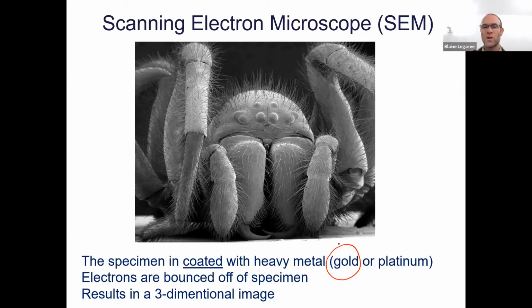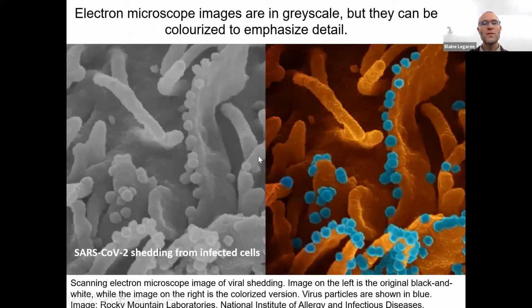And you can see this note here. It says that in scanning electron microscopy, you're actually getting kind of a 3D surface image. So the electrons hit the object, and they bounce off, and then the computer reads the signal as either intense or not intense, and so you get these different shades, and you get a 3D image. Another thing you may have noticed, these images are mostly grayscale. So electrons don't have colors, by the way. Electrons just have intensity. So high intensity equals kind of light or bright. Low intensity equals dark. We do add color often to make the image pop out and look a lot more attractive. So you'll see a lot of these images in your textbook, and all the colors have been added false.